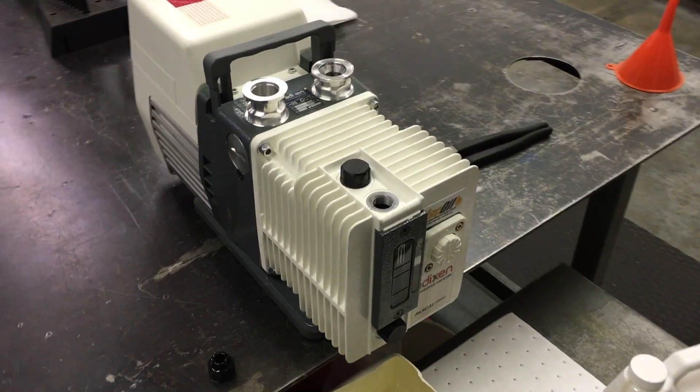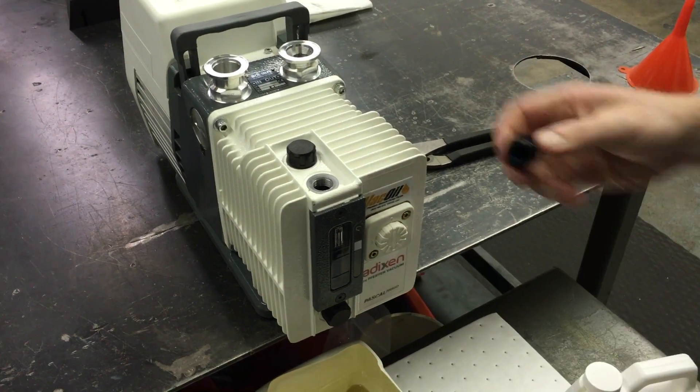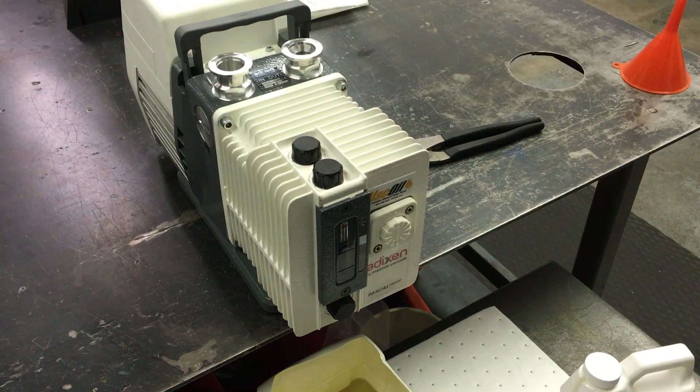Now remove the funnel, replace the fill plug, and you're done. Regular oil changes will prolong the life of your vacuum pump and allow you to achieve optimal vacuum levels.